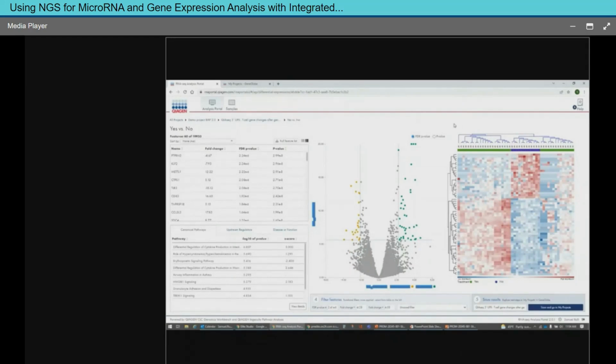Some of the T cells are the wild type strains, and then some of them have had CRISPR screens done with them where certain things were knocked out. And then the cells were treated with and without ways to activate them. With the no treatment versus the treatment, you can see that we are getting some nice gene expression profiles that can tell us the difference between the purple, which are not treated, versus the green ones.